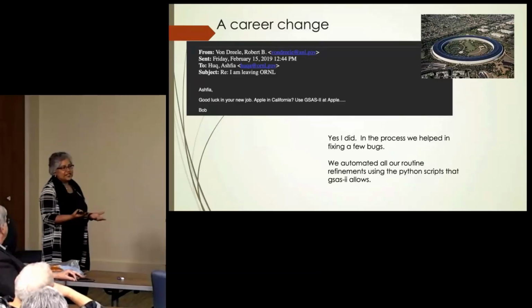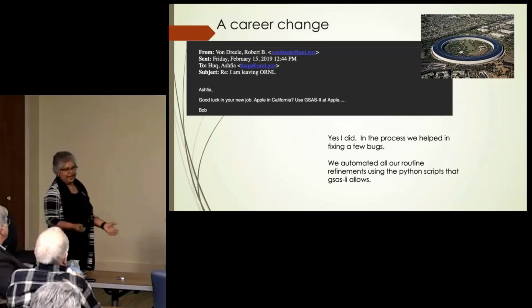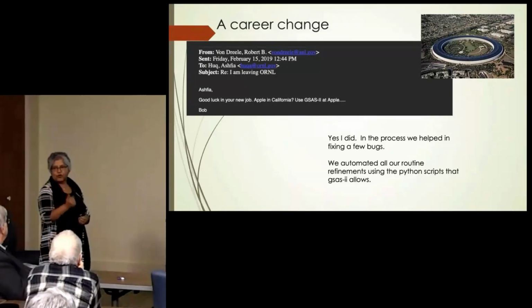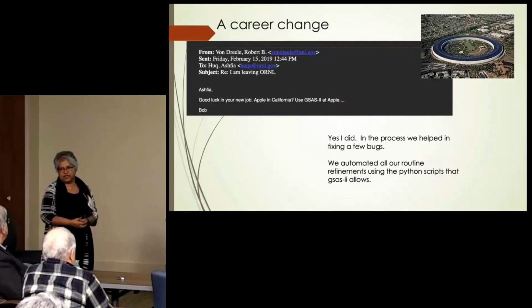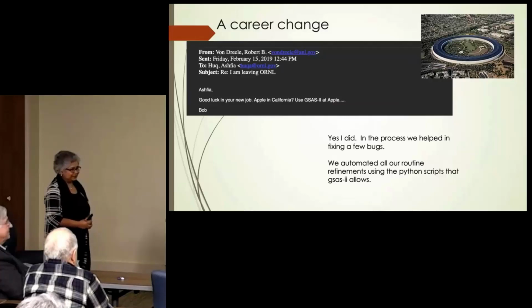And one thing I learned in industry is you do the same thing over and over again, and you don't want to do that manually. So we used the Python programming feature where we wrote everything that we did over and over again and could hand it over to a technician who could just collect the data, analyze the data, and generate the table that people were interested in. So that was a wonderful feature, that we could write Python code and use GSAS-II. I'll take that, thank you.